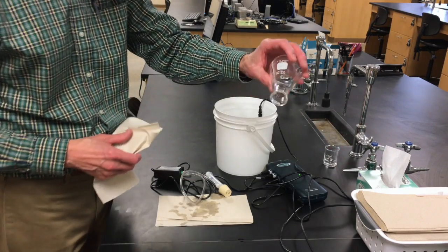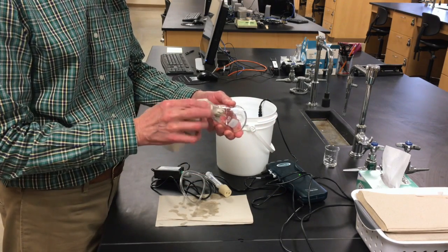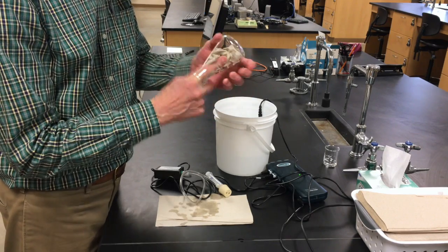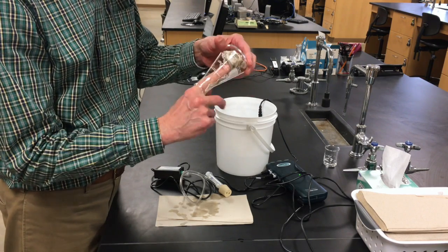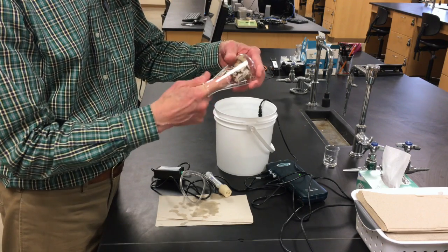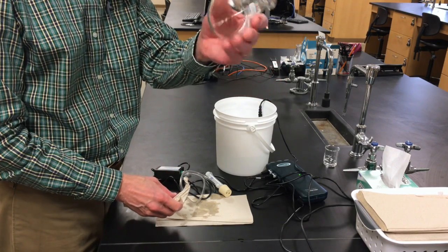Now there still may be some drops of ethanol in here, so we take a dry paper towel and dry it out, because we want it to be completely dry before we use it again. You should have 2 of these 125 milliliter Erlenmeyer flasks in your drawer, so you can use the second one for the second liquid to give this a little bit more time to dry out. But I have dried it. There are no droplets in there now.